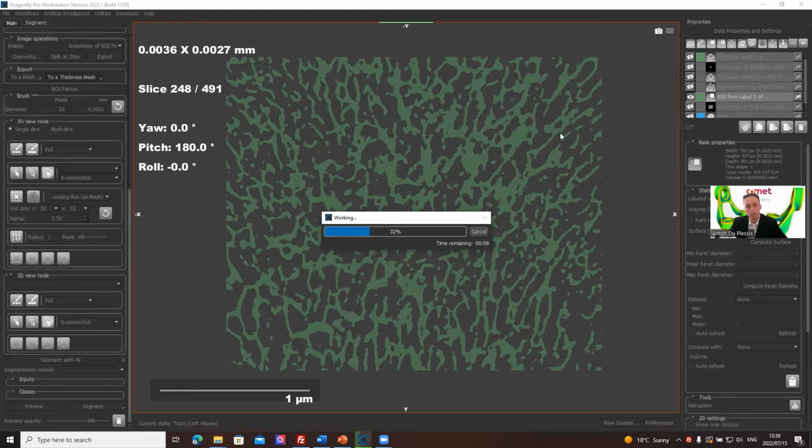It shouldn't be taking too long. This is quite a fast method to get a thickness map. So after I do the thickness mesh and measurement inspector, I would like to show you the vector field calculation based on the bone, because the bone has structure which is oriented in different directions.